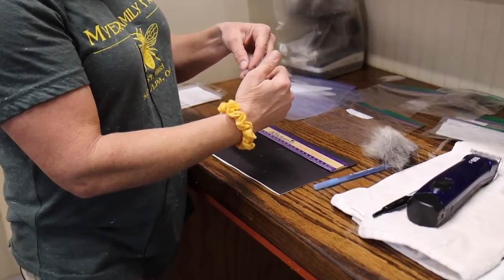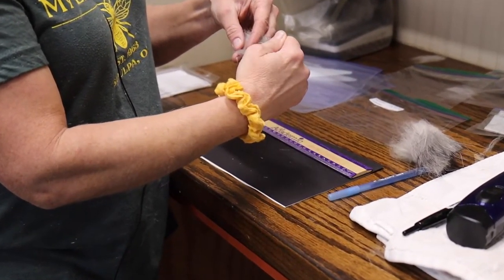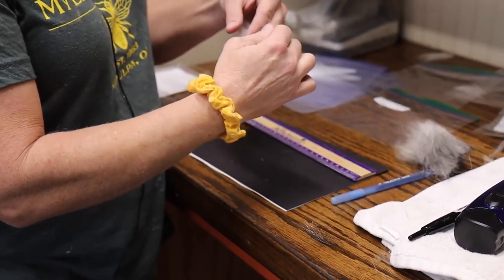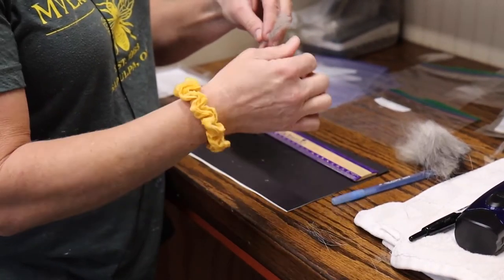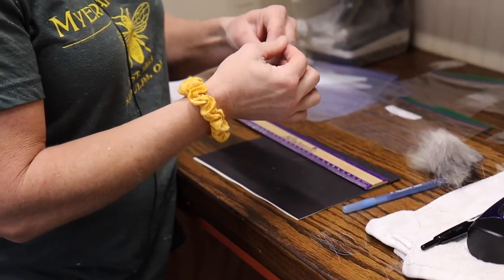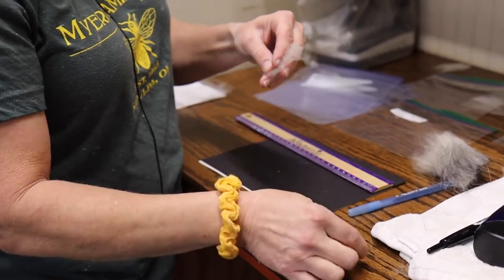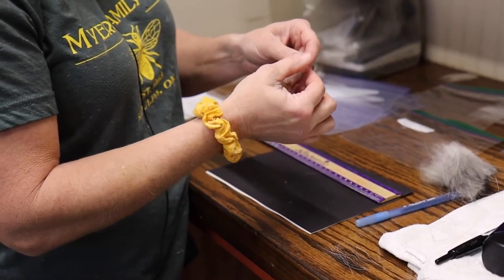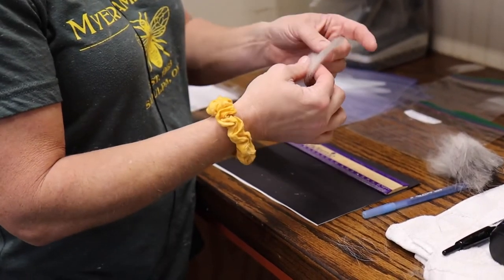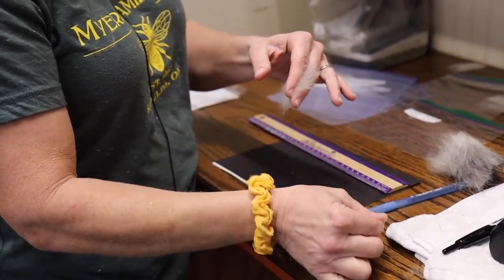I'm just going to grab all the guard hairs that are cut while holding onto the sample and pull those out. This is poor man's de-hairing. I'm going to get enough of those out that I can see the actual end of the cashmere, where the cashmere starts. I don't have to get them all out — just the ones that are easy.